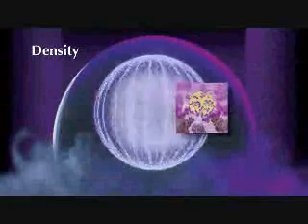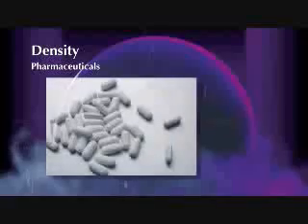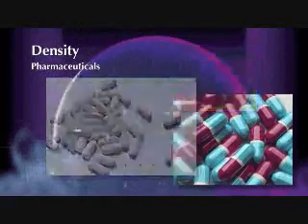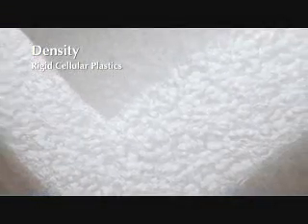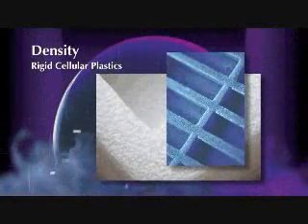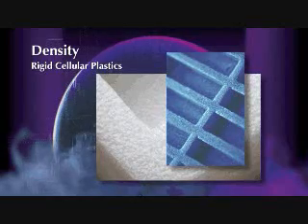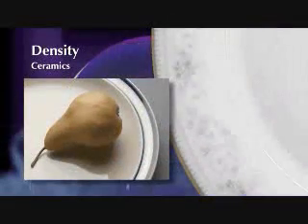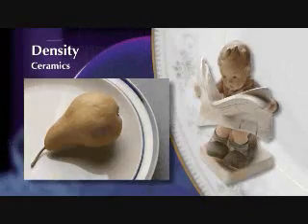Gas pycnometers use a gas displacement method to accurately measure volume and calculate density. Composition of active and excipient ingredients can be monitored and controlled through determination of product density. Closed-cell rigid plastics exhibit different properties based upon the ratio of open and closed cells. Insulation foams limit thermal conductivity through pockets of trapped gases contained within closed pores. Density measurements can be used to determine closed porosity from casting, sintering, and forging operations, where parts are made from powdered samples.